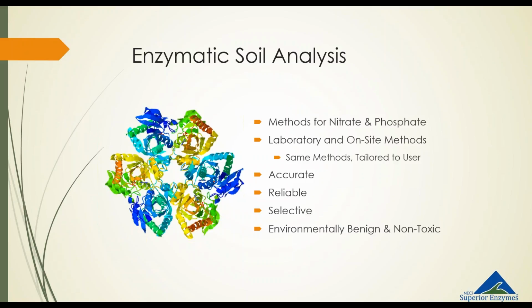We want these methods to be accurate, reliable, and selective, meaning that you don't need to do a lot of sample prep. The enzyme will find your analyte in a very complex mixture. The other advantage of enzymatic methods is that they're environmentally benign. There are no toxic reagents in here, especially for the field kits.